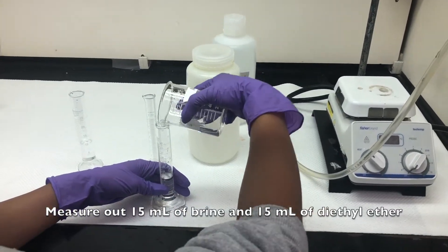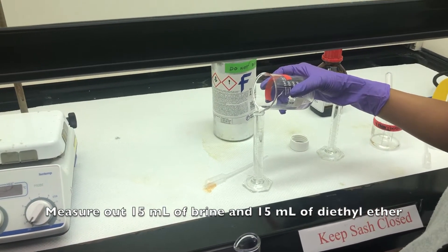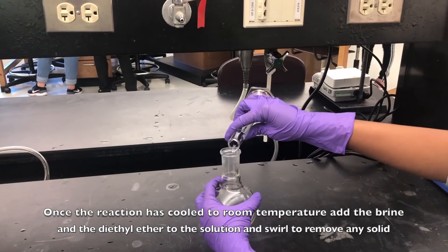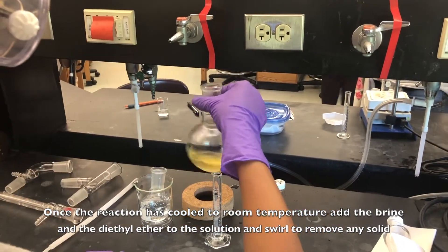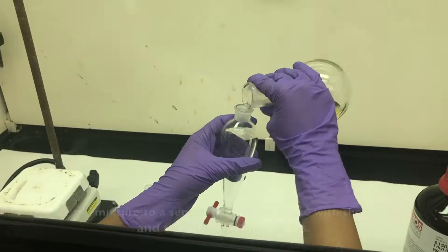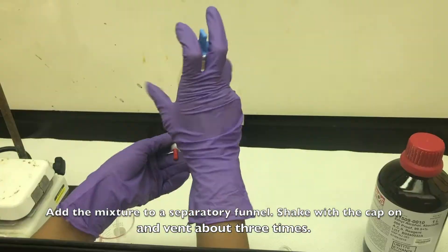Measure out 15 milliliters of brine and 15 milliliters of diethyl ether. Once the reaction has cooled to room temperature, add the brine and the ether to the solution and swirl to remove any solid. Add the mixture to a separatory funnel, shake with the cap on and vent about three times.